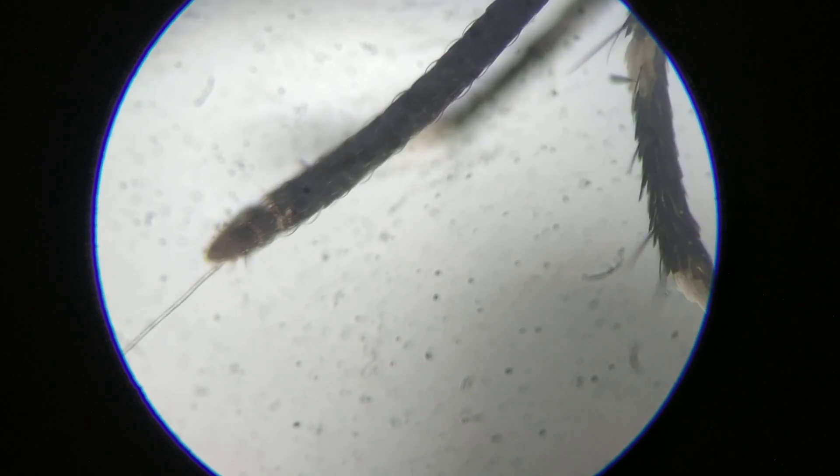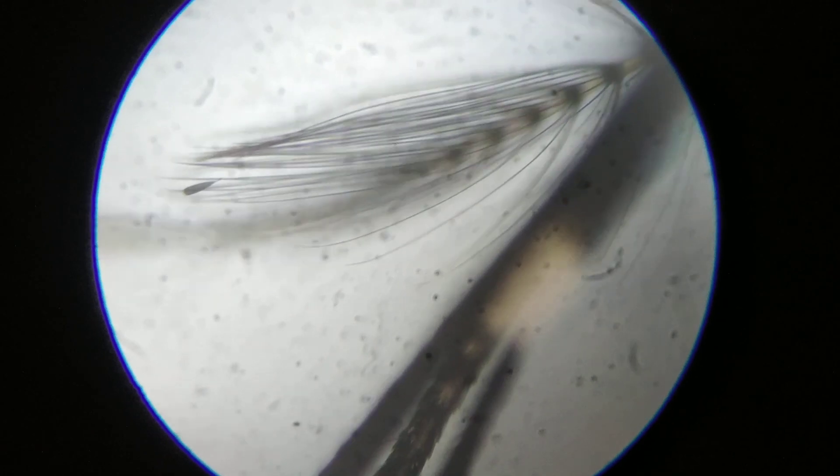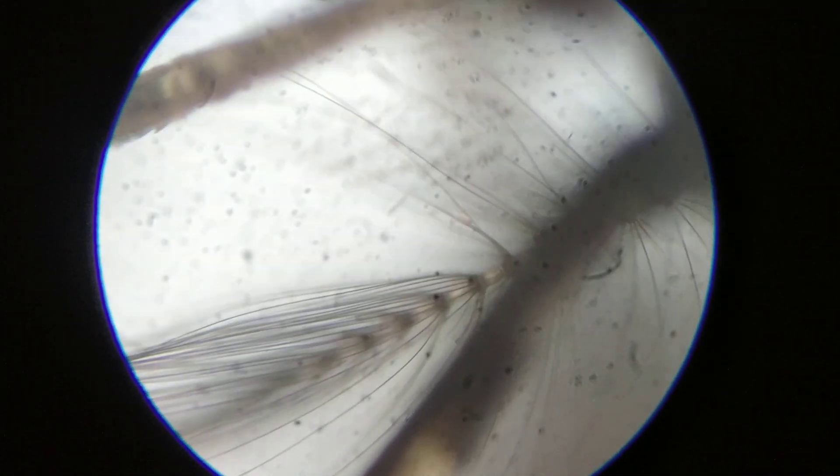Hello there children. Welcome. Here I am going to show you the microscope image of the mouth parts of the female Anopheles mosquito.